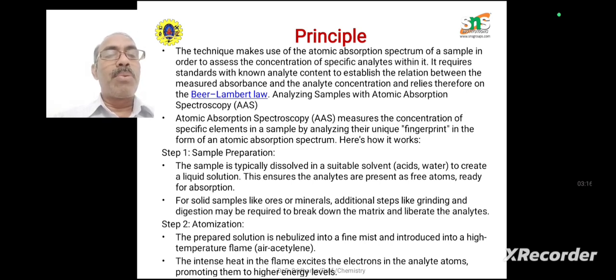Step 2, atomization. The prepared solution is nebulized into a fine mist and introduced into a high temperature flame with the help of air acetylene as a fuel. This intense heat in the flame excites the electrons in the analyte atoms, promoting them to higher energy levels.